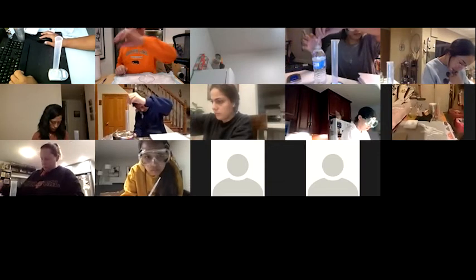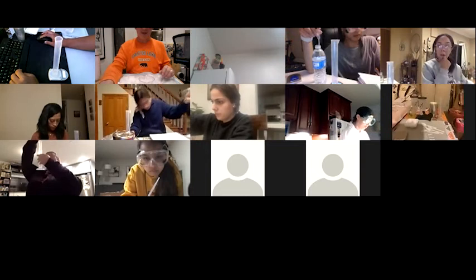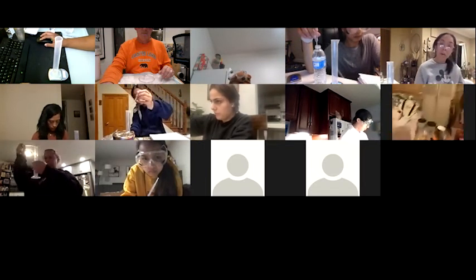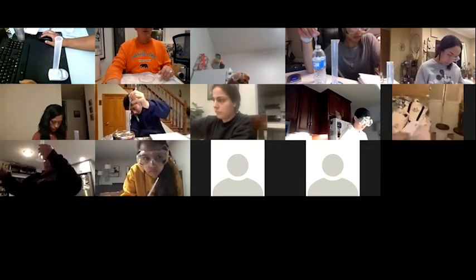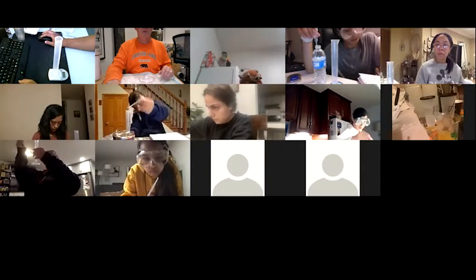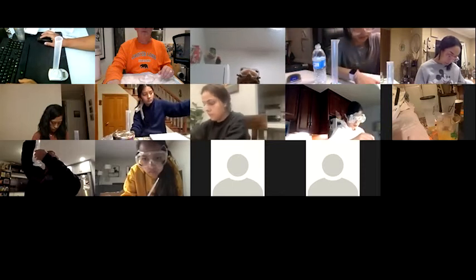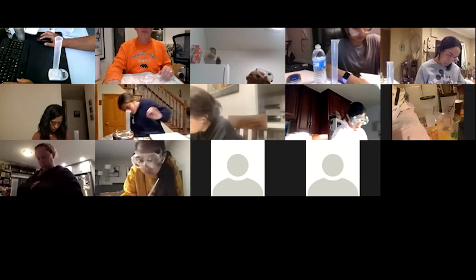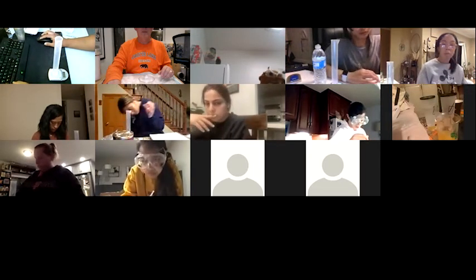So to make the solutions, we have the instructions here. Professor? Yeah. Since water's like 1 gram per milliliter, can't we just add the number of milliliters to the mass of the cylinder, and that'd be what you get?